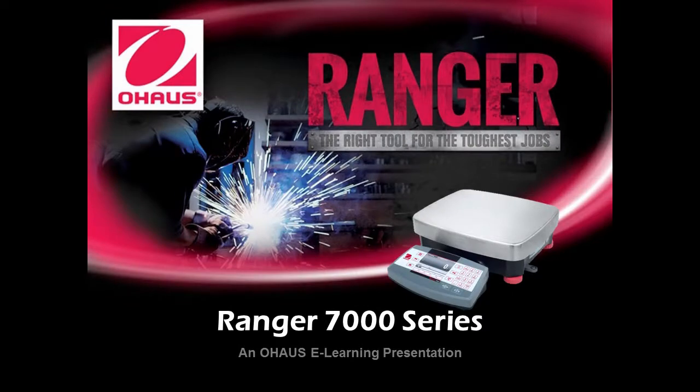Welcome, and thank you for taking the time to learn about OHAUS Corporation. In this e-learning program, you'll learn about OHAUS's new industrial compact bench scale, the Ranger 7000 series. I'm very excited to be providing you with this e-learning introduction of this unique product.